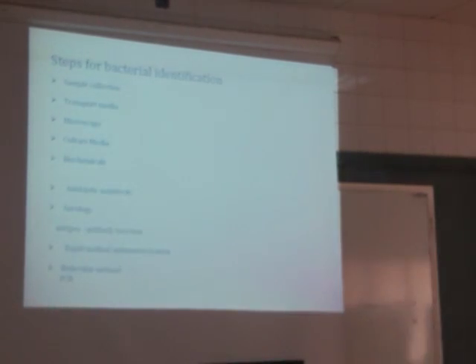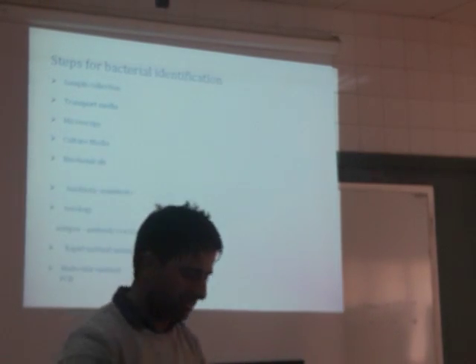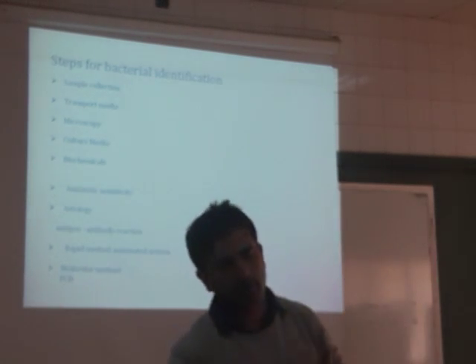You need food, like we eat food for our survival, microbes also need food for living, okay? So this plate has this cover and this is the bottom. It's called a culture plate. What is inside here? Food. But in microbiology terms, we call it culture media. You have a sample of urine, or even pus or something, and you put the sample here. The media can be MacConkey, it can be blood agar, it can be nutrient agar, or another type of agar.